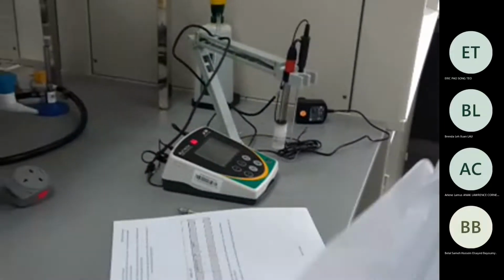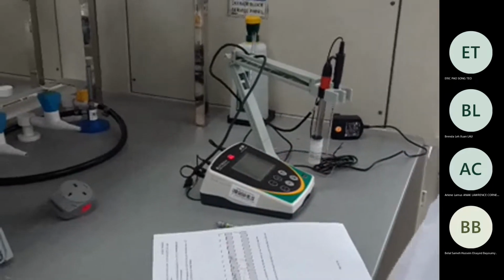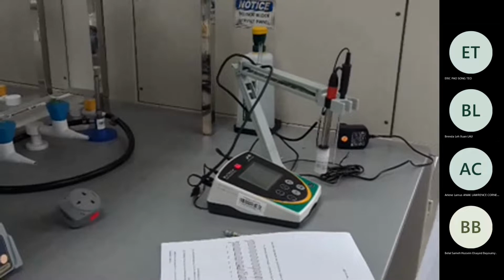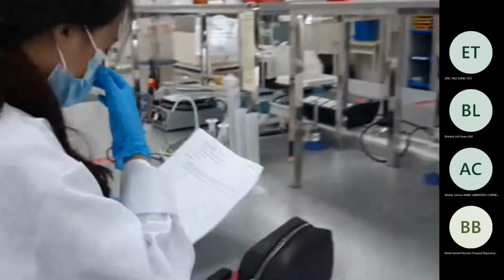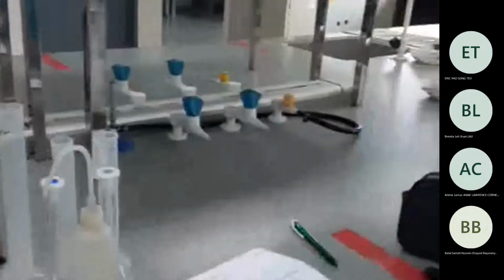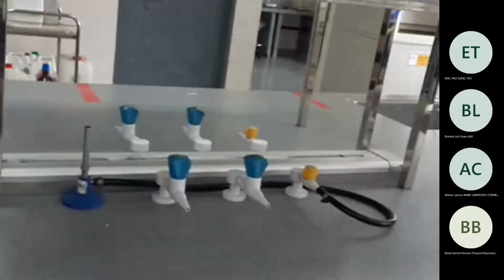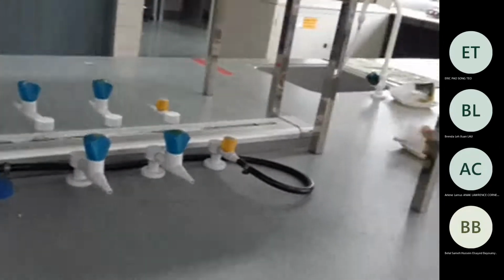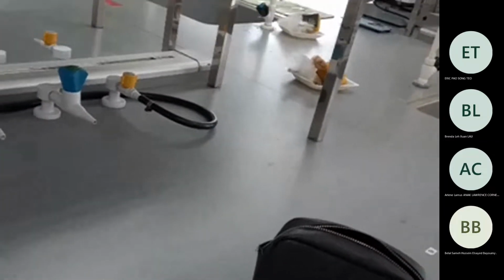What should we be doing? If it has been done, yeah, we need to rinse the apparatus first. So rinse the apparatus with distilled water, and then we proceed according to the procedure that we dilute the hydrochloric acid, and then we determine the pH of that. And so on. After the pH probe, repeat with ethanoic acid as well.